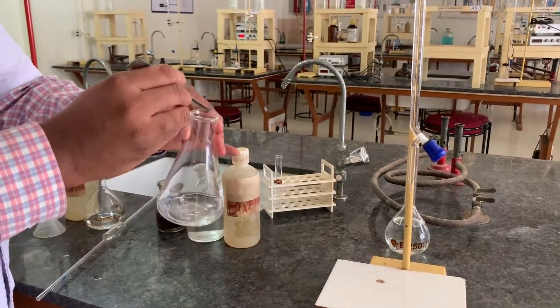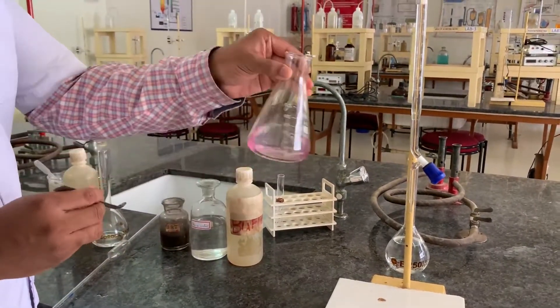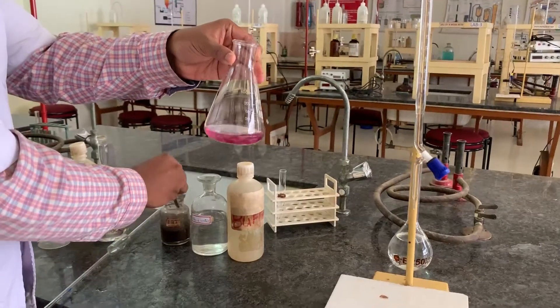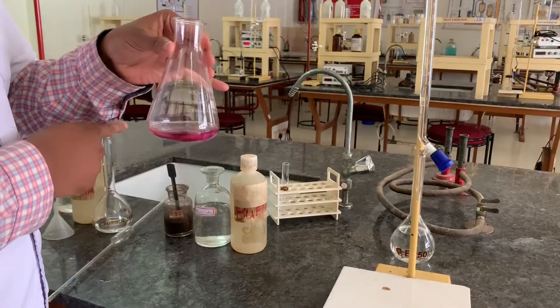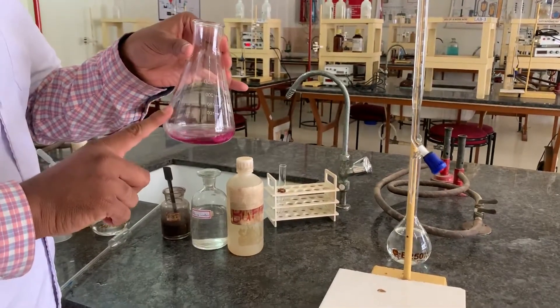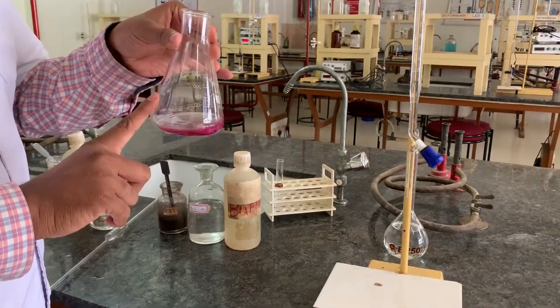You can observe that as soon as eriochrome black T indicator is added, the color of the solution turned into wine red. This indicates that there is a formation of complex between eriochrome black T indicator and calcium and magnesium ions present in the hard water.